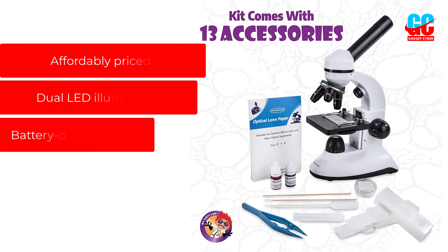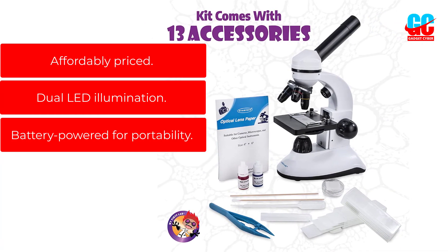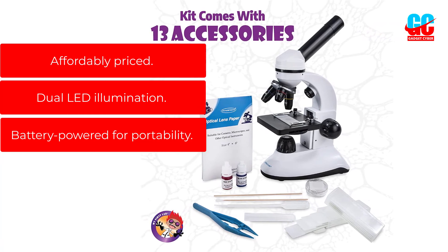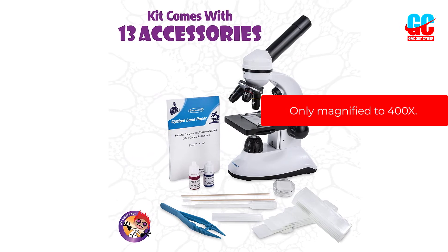Pros: Affordably priced. Dual LED illumination. Battery powered for portability. Cons: Only magnifies to 400x.